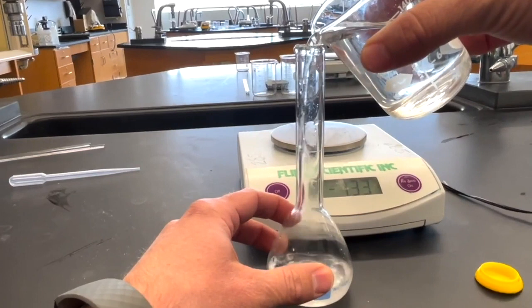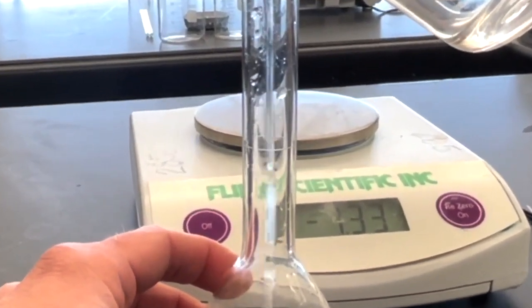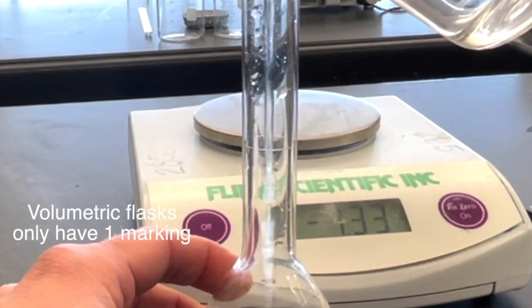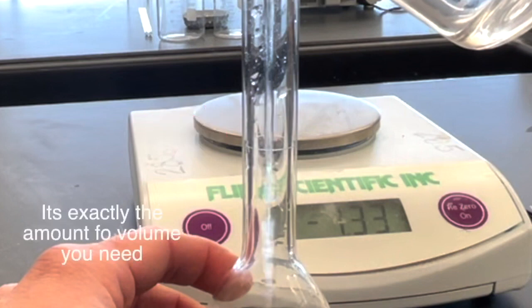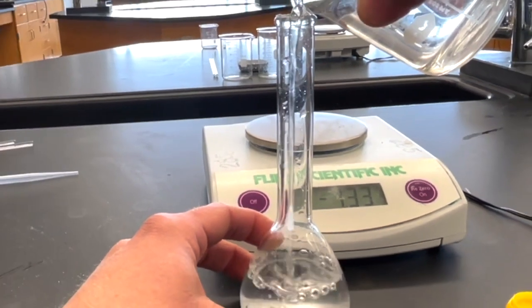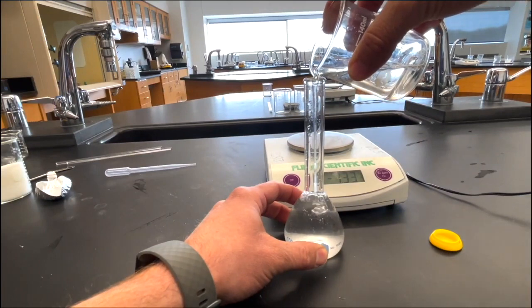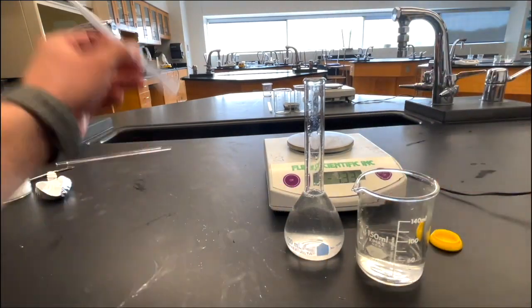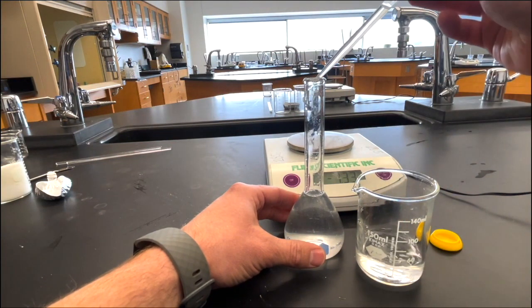Now remember, the volumetric flask only has one marking, and as I zoom in on it, you can see in gray, this one marking, I'm going to point at it with an arrow because it might be a little bit difficult to see, represents exactly 100 milliliters of liquid. Next, you can see me adding water up to the bottom, right where the neck gets really narrow. And that's where I stop adding water because I don't want to go past the line. I want to go up to the line but never past it.